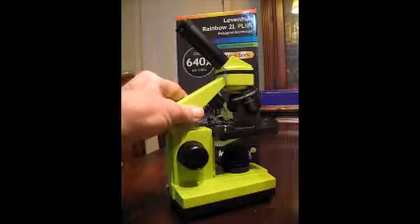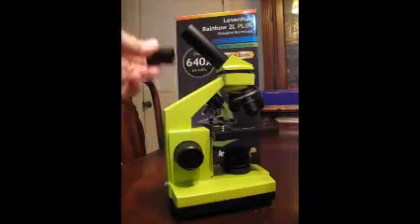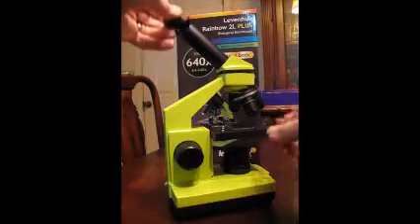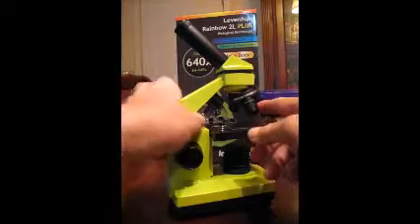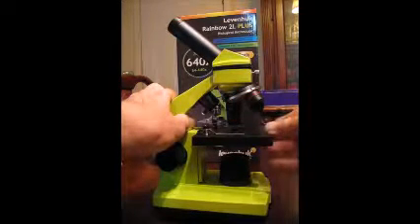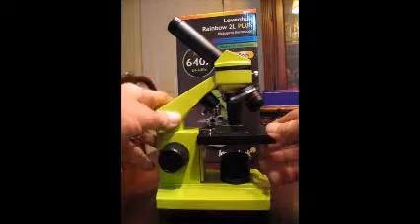Going from top to bottom: up here on the top is the eyepiece, which is 16 power, and that multiplies by whatever the power of the lens is. The three lenses are mounted on a turret — they are 4, 10, and 40 power — so you just multiply those by 16 to get the actual magnification power.